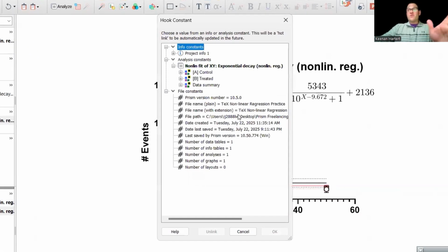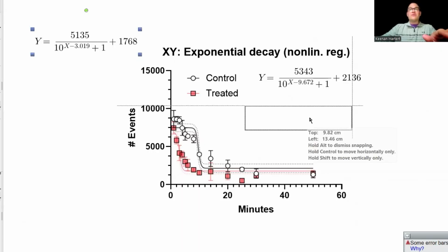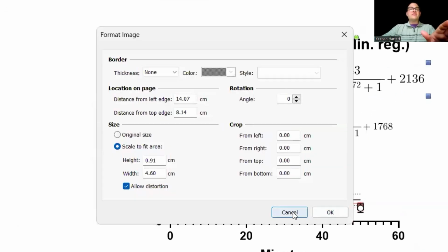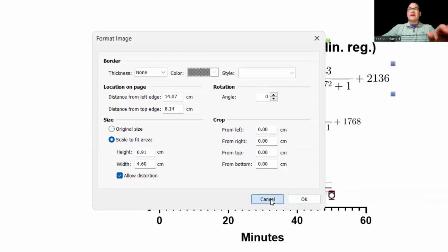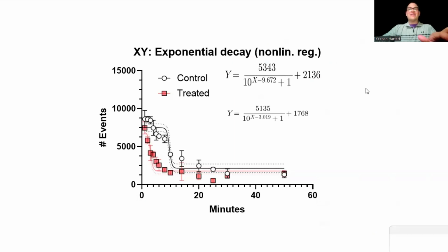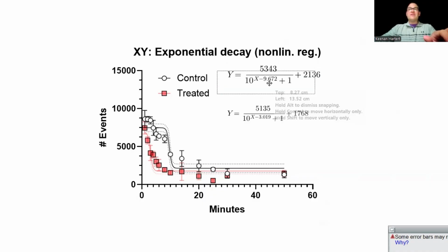So the TeX format is going to depend on what you asked of it, but the full equation now, as you can tell, is going to come through in the universal design. And you can resize both of these, make them a little smaller so that they're going to fit nicely with whatever your legend is. And again, you can customize it by double clicking like that. But most of the time you're going to find a nice fit. And I'll be careful like I wasn't right there. And you're going to find a nice fit for each of the equations.